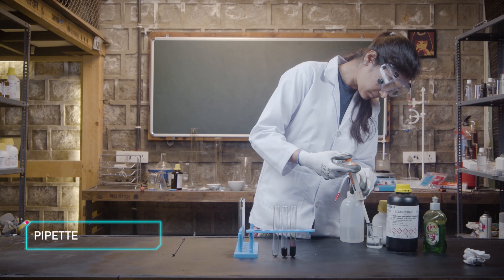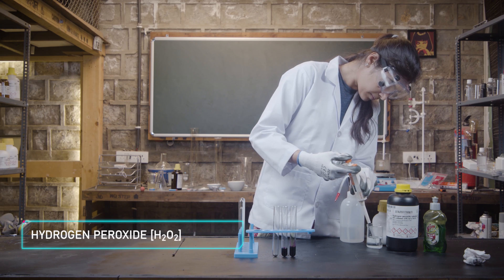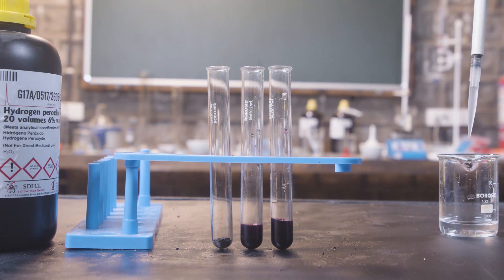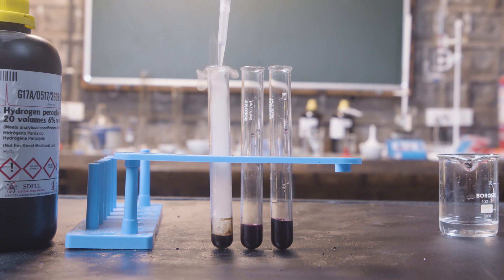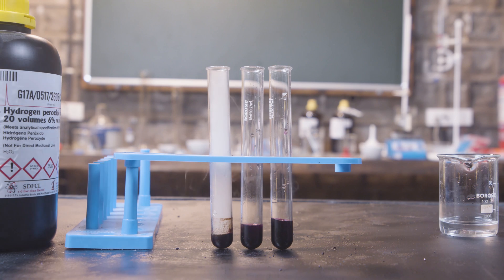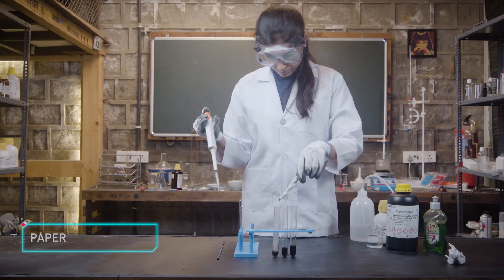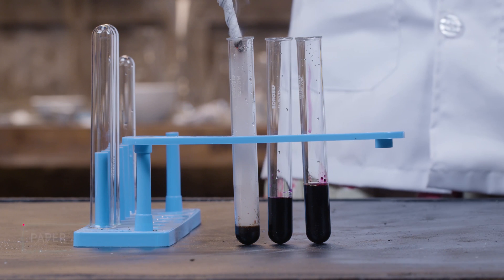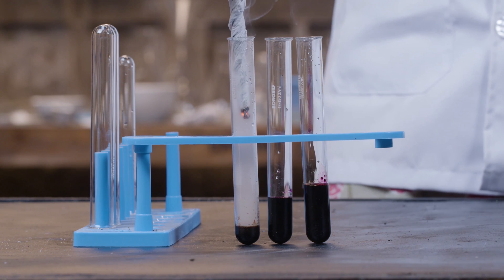Next, take your pipette and pour in some hydrogen peroxide into the first test tube that has just potassium permanganate. Do you see how that vapor rises right up? Now roll up a paper, light it up and insert it into the same test tube.